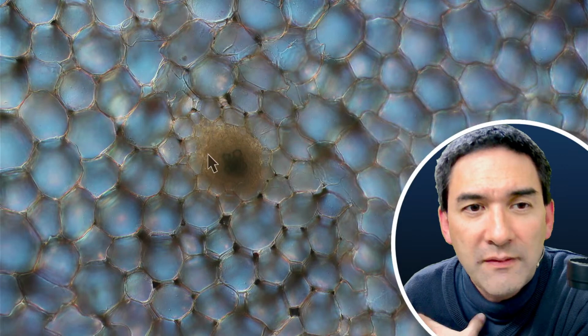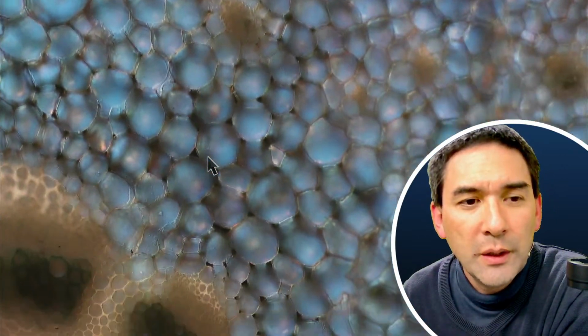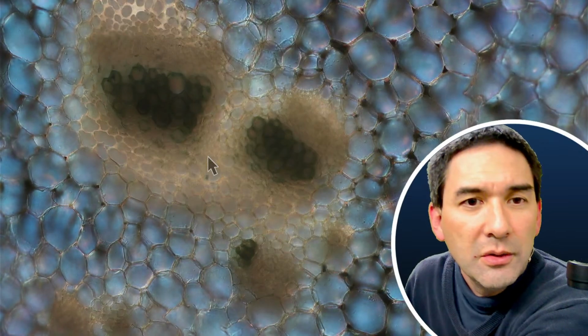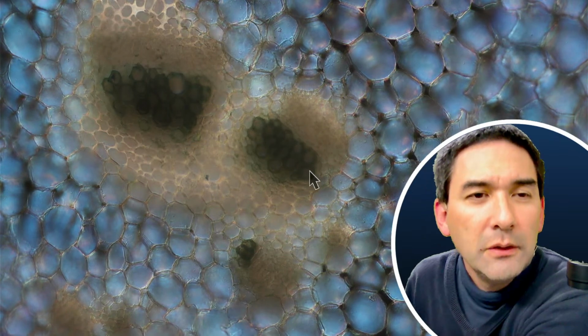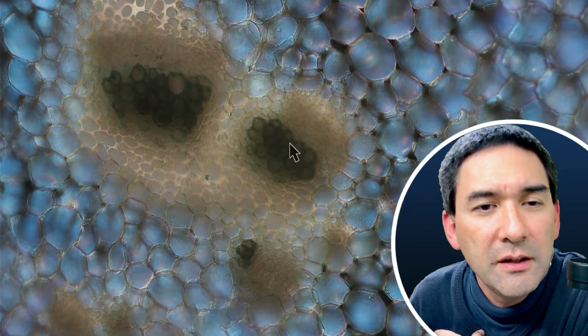Okay, so we see a whole bunch of cells here, and the question is, what are these things? These are the so-called vascular bundles. Let me maybe find a different one. And yeah, here, big ones, right? And those vascular bundles, if you look carefully, they too are made of individual cells. And if you look carefully, you can see that the cells in here have a thicker cell wall.